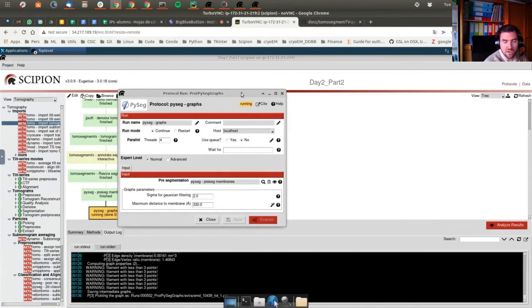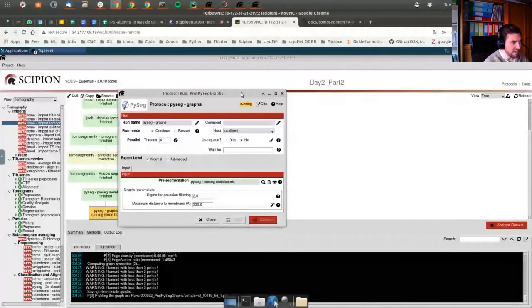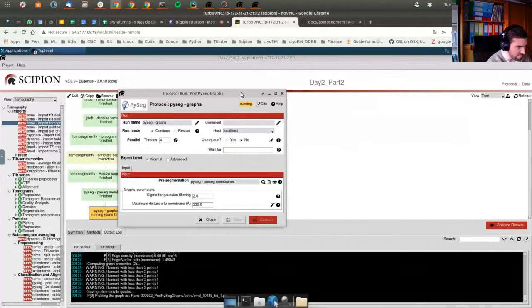I think you are saying that this is going slower than you expected. I don't know, but yesterday I had the same impression that even though these machines are powerful, more powerful than ours, things were going a little bit slower compared with us. I don't know specific details about this. I know the RAM and the number of CPUs, but I don't know anything about the disk. Maybe there's the problem. Yeah, the parameters are the same as you remember, is 2.